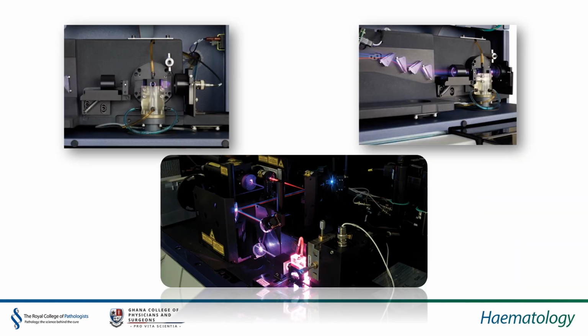So you can see, this is what they call the flow cell here. You've got these prisms which are sort of focusing the light down into very fine beams. You can see lasers and information being detected within the flow cytometer. And how do these boxes that contain all these wires and lasers and this sort of intricate network of detectors within this system, how do they work?